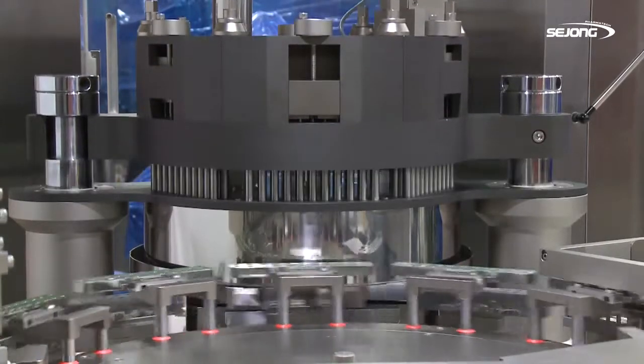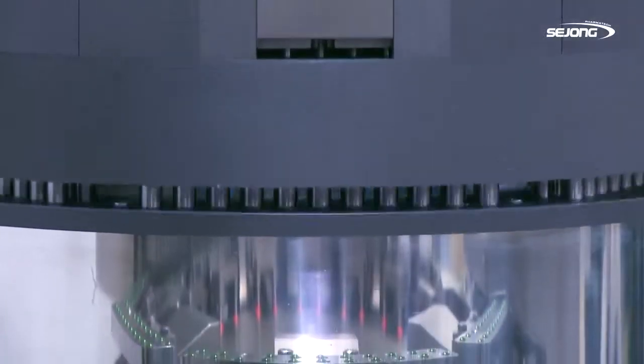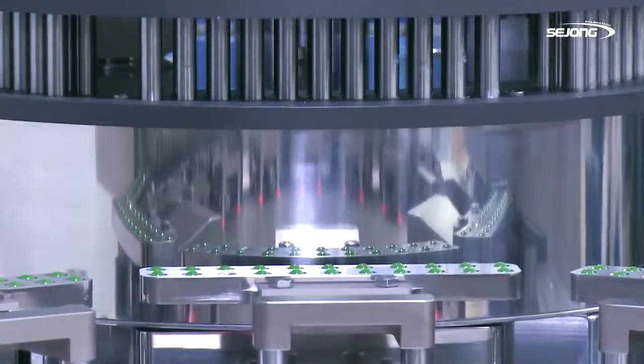It adopts a multi-level compression method. It can carry out compression molding on filling capsule in five stages before inserting them into a capsule.